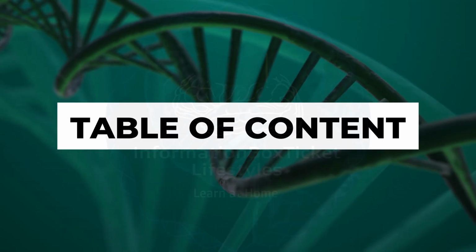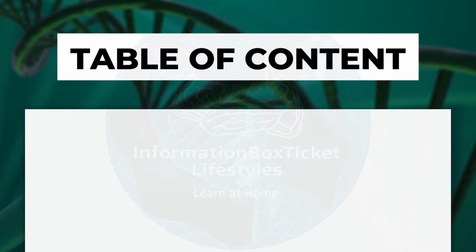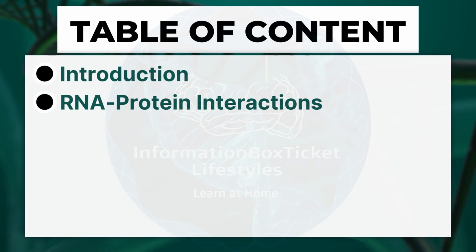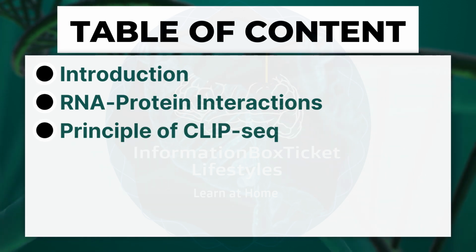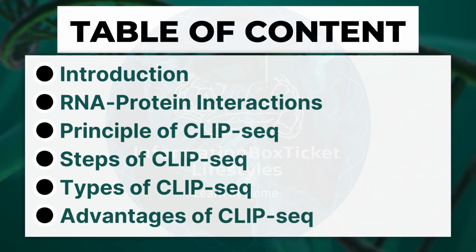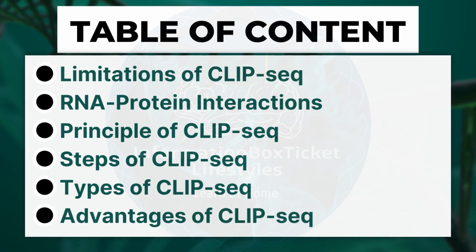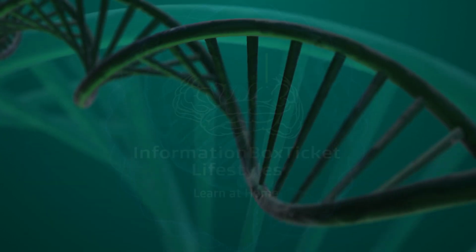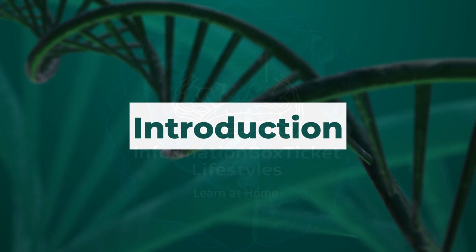Table of contents. Introduction. RNA-Protein Interactions. Principle. Steps. Types. Advantages. Limitations. Applications. Introduction.